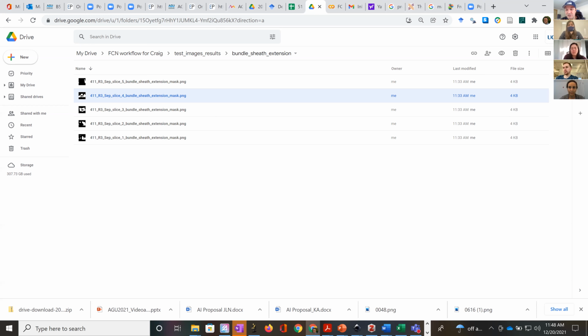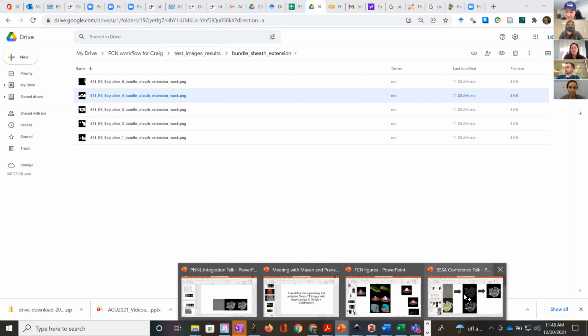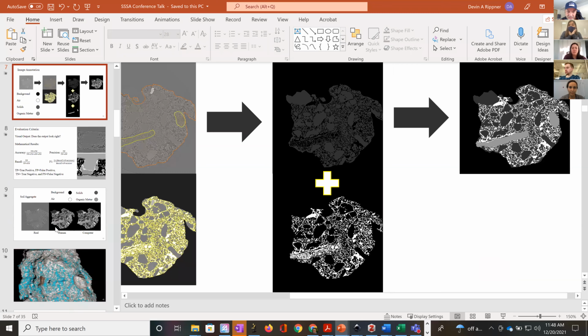So some of Mina's images are 500 by 1,000 pixels, and some are 500 by 2,000 pixels. You need more images to mix and match sizes like that, but you can also make a generalized model that will segment any of those sizes. Let me see if I can find an example of that.